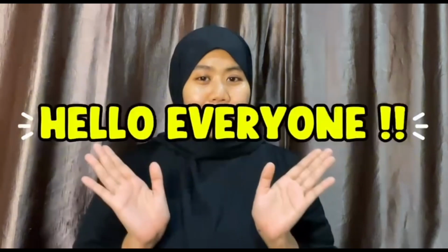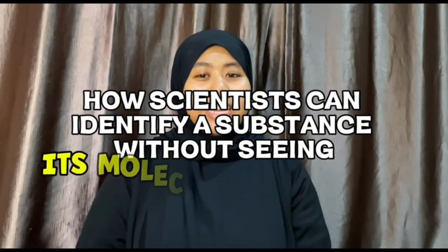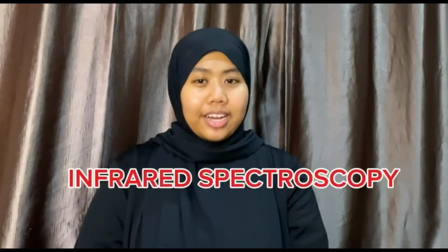Assalamualaikum. Hello everyone. Have you ever wondered how scientists can identify a substance without even seeing its molecular structure? One powerful technique used to do this is infrared spectroscopy, commonly known as IR spectroscopy.